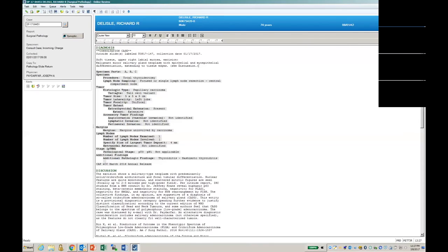And then I think you guys already answered this. It sounds like you can, but besides the CAP checklists that come and I assume are automatically updated, you can build your own structured report templates. So is that correct? It is correct. There's the tool that we use to build and update the checklists. It's called the Agile Author, and that is available for license if you wanted to build your own. Actually, it's funny because Dr. Pettis is coming down here in a couple of weeks to be trained on that.